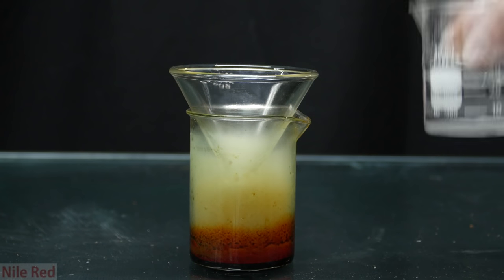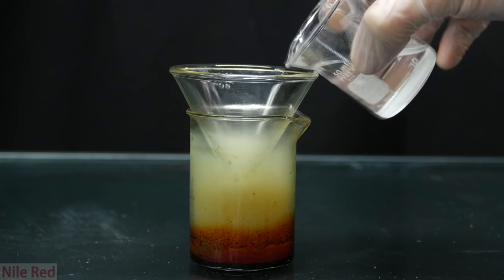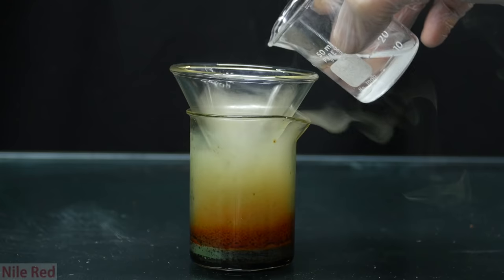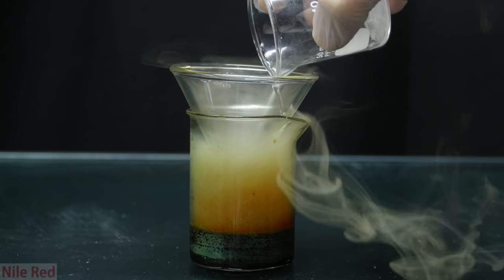To neutralize the hexavalent chromium, just like before, we add in some sodium sulfite solution. It quickly turns to the green color. I mix it around and add it to the chromium waste.